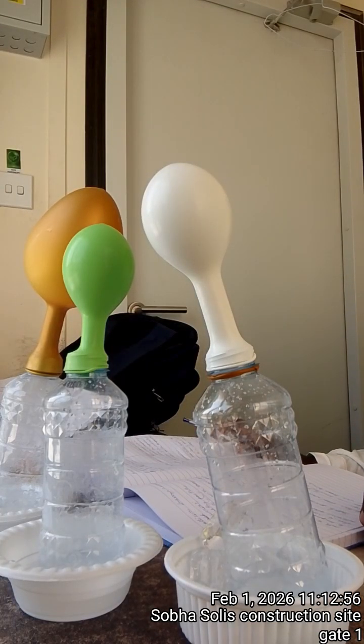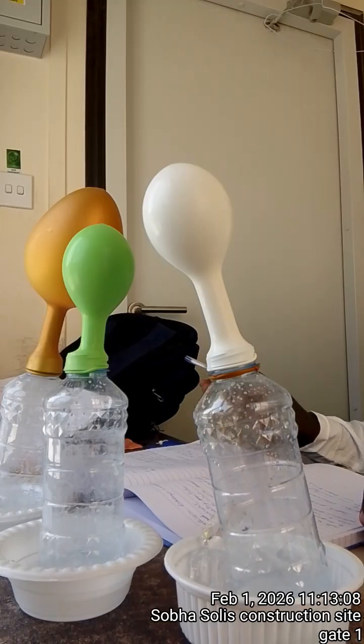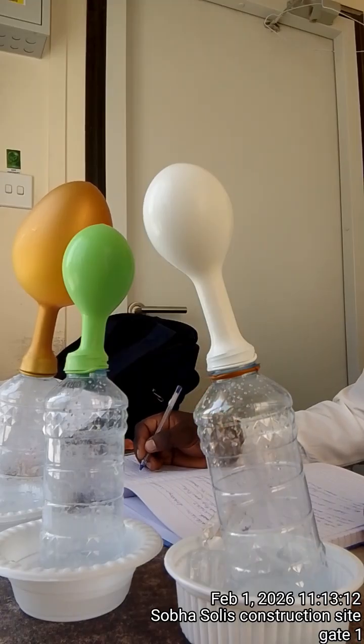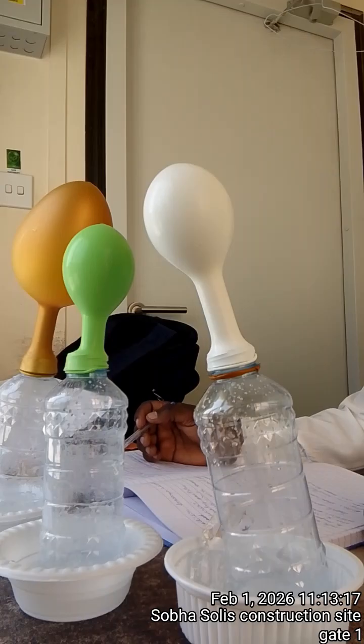so far this experiment is standing at different time intervals. If you look at it very well, this one was the first. It is 95 seconds.